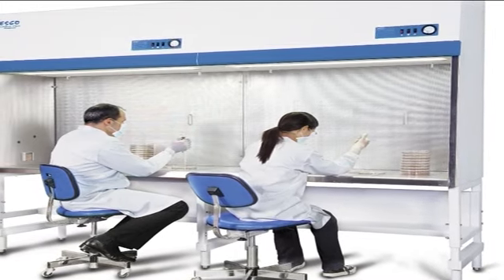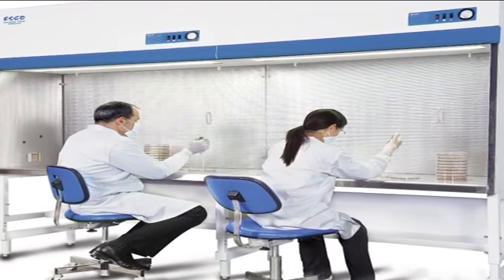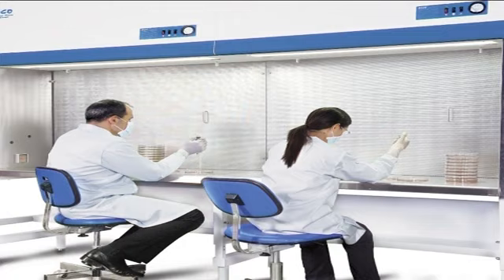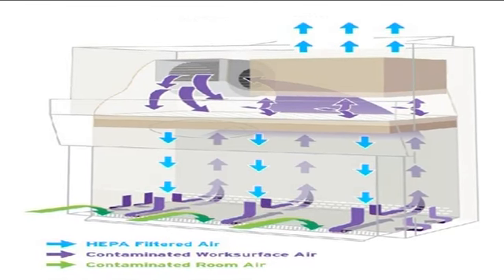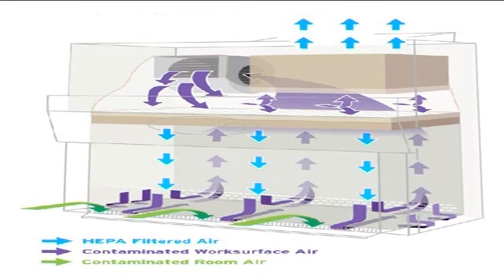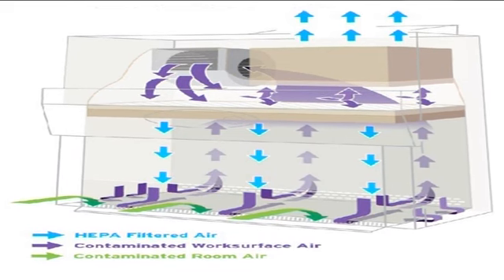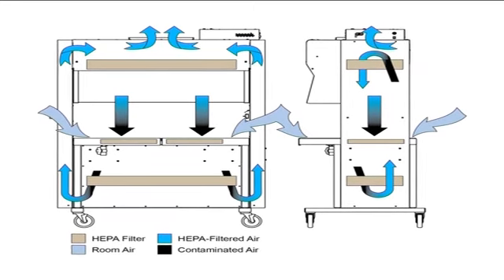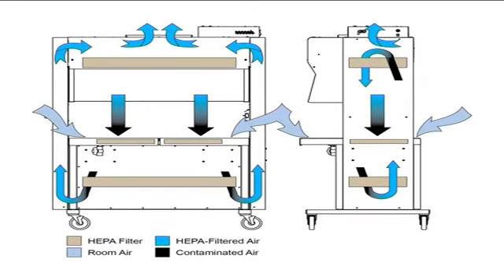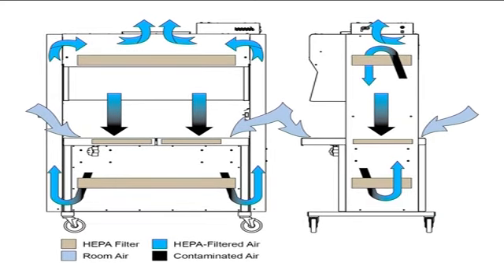Because of these characteristics of laminar airflow, it has participated in clean room and clean bench technology for many decades. In general, the unit consists of a bank of high efficiency particulate air, that is HEPA filters, enclosed in a cabinet or hood. The air stream at descent velocity moves essentially in a parallel pattern, so that the cleanliness of the air is independent of activities occurring down or cross stream.